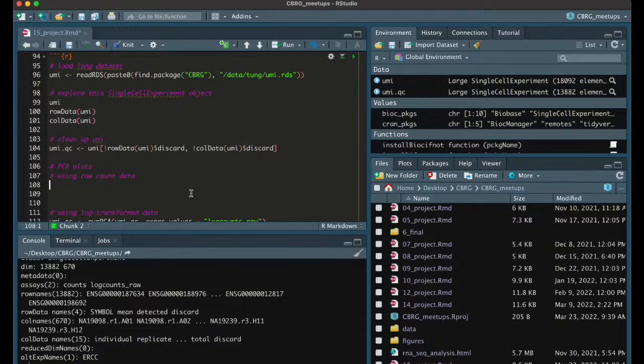So if we use some kind of visualization approach like principal component analysis, we would expect or hope that the cells that correspond to the biological replicates all kind of cluster with each other, and there's a separation, hopefully, between these 3 biological samples. What we don't want to see is separation within the biological samples of the 3 technical replicates. If there is any separation, this is an indication of some kind of technical artifact or batch effect.